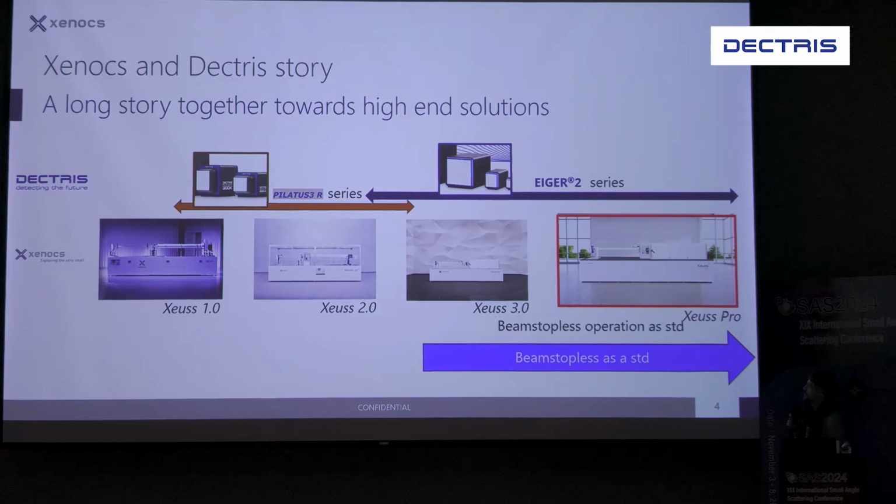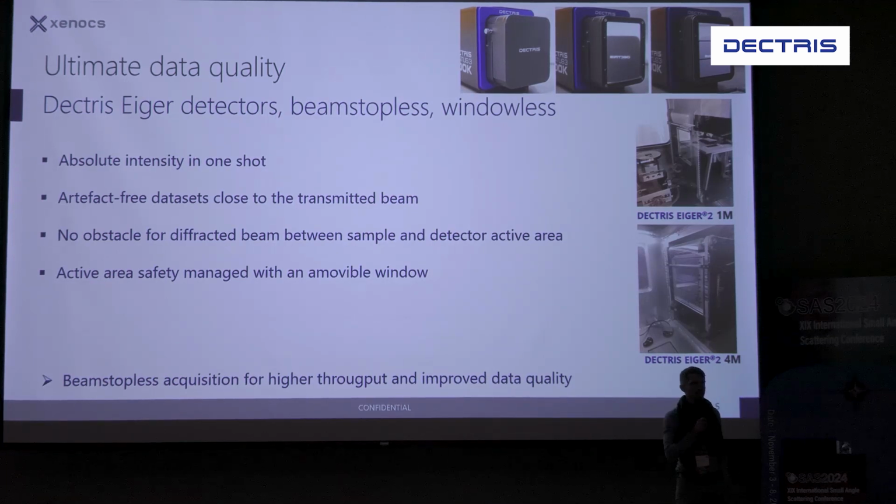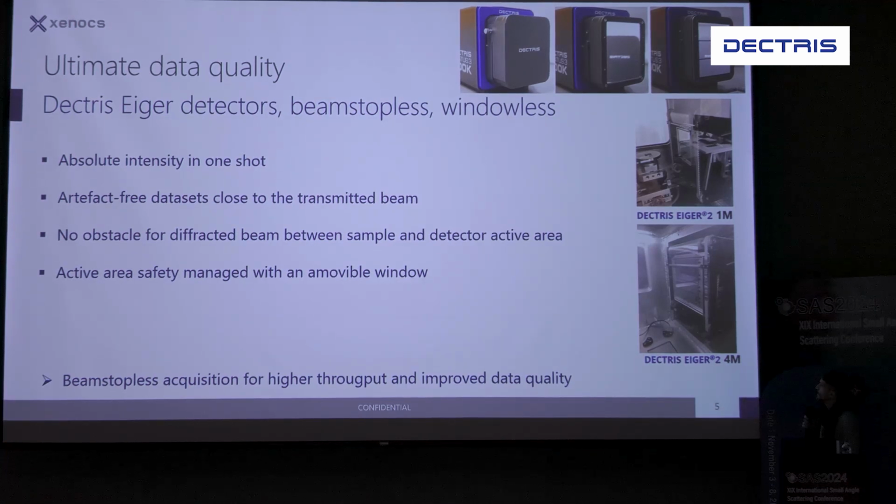And ever since we started using EIGER detectors, we've been using them in a so-called beam-stopless operation, meaning not only that you don't have a beam stop on your beam, but there is no window, no obstacle between your sample and the detector. So your final data is less prone to artifacts, and you don't have to worry about possible artifacts or rely on subtraction to get features very close to the beam, which is quite interesting. I need to mention, however, that we still have a removable window to protect the detector when potentially dangerous samples are used in the system.